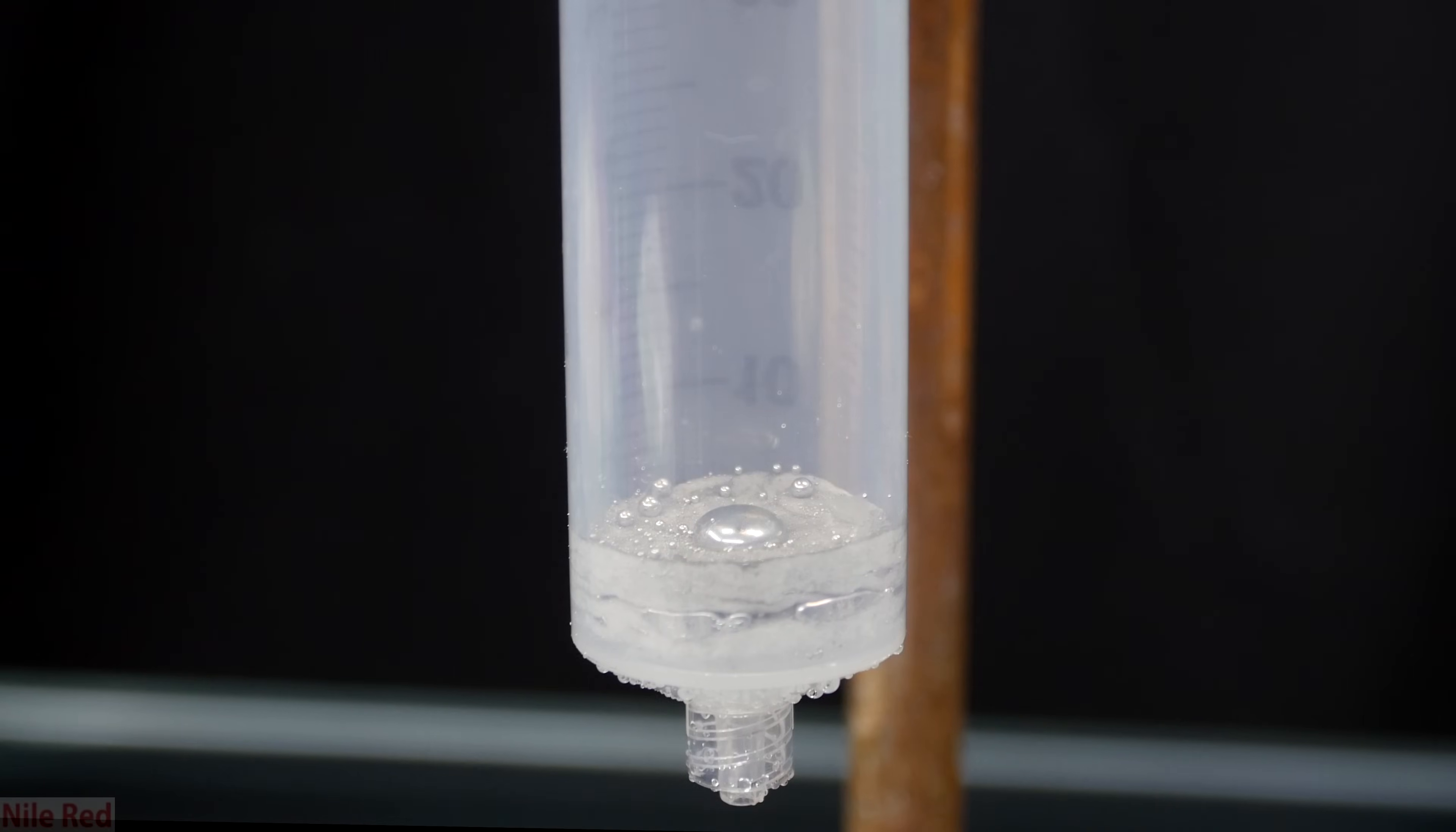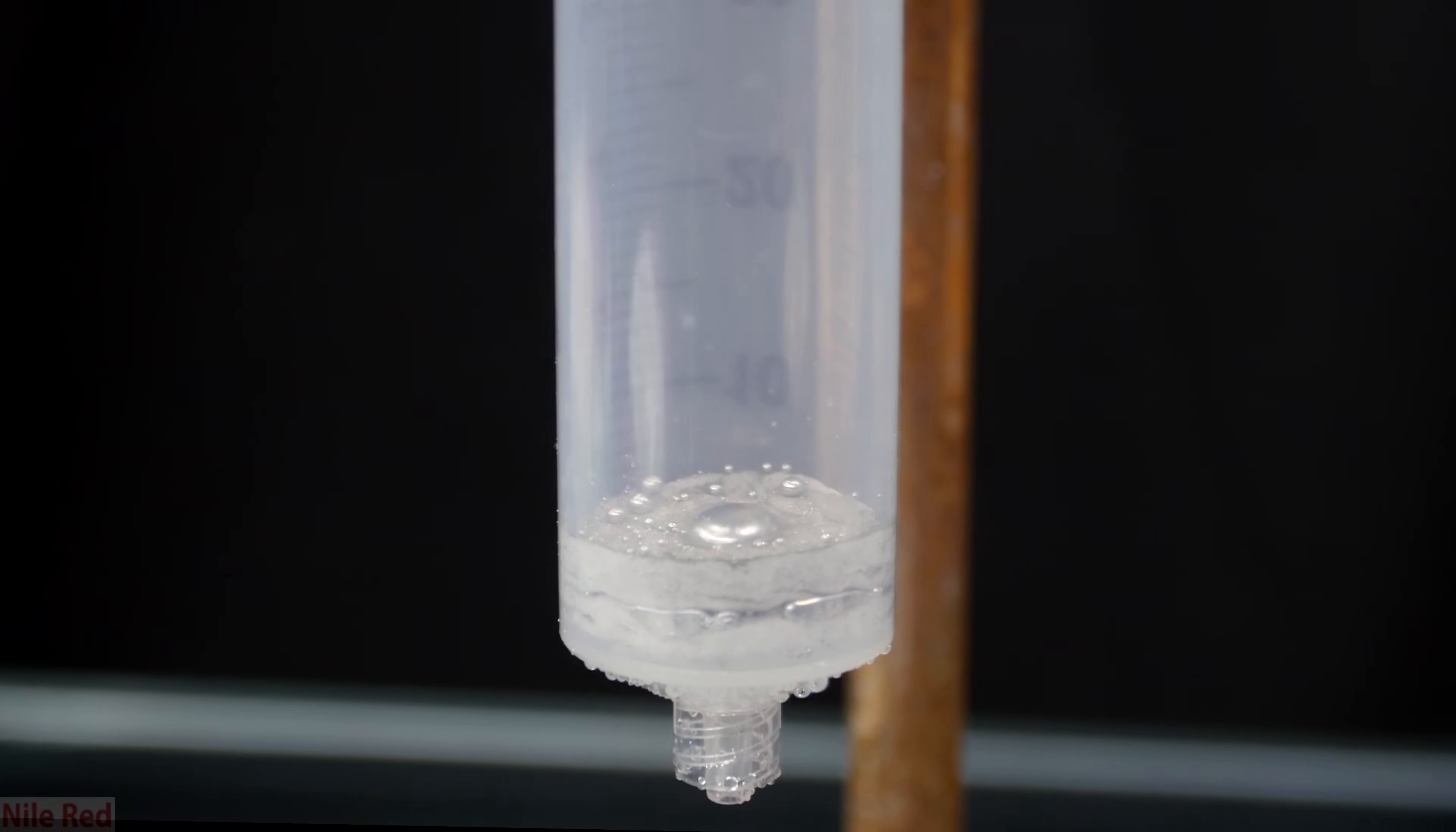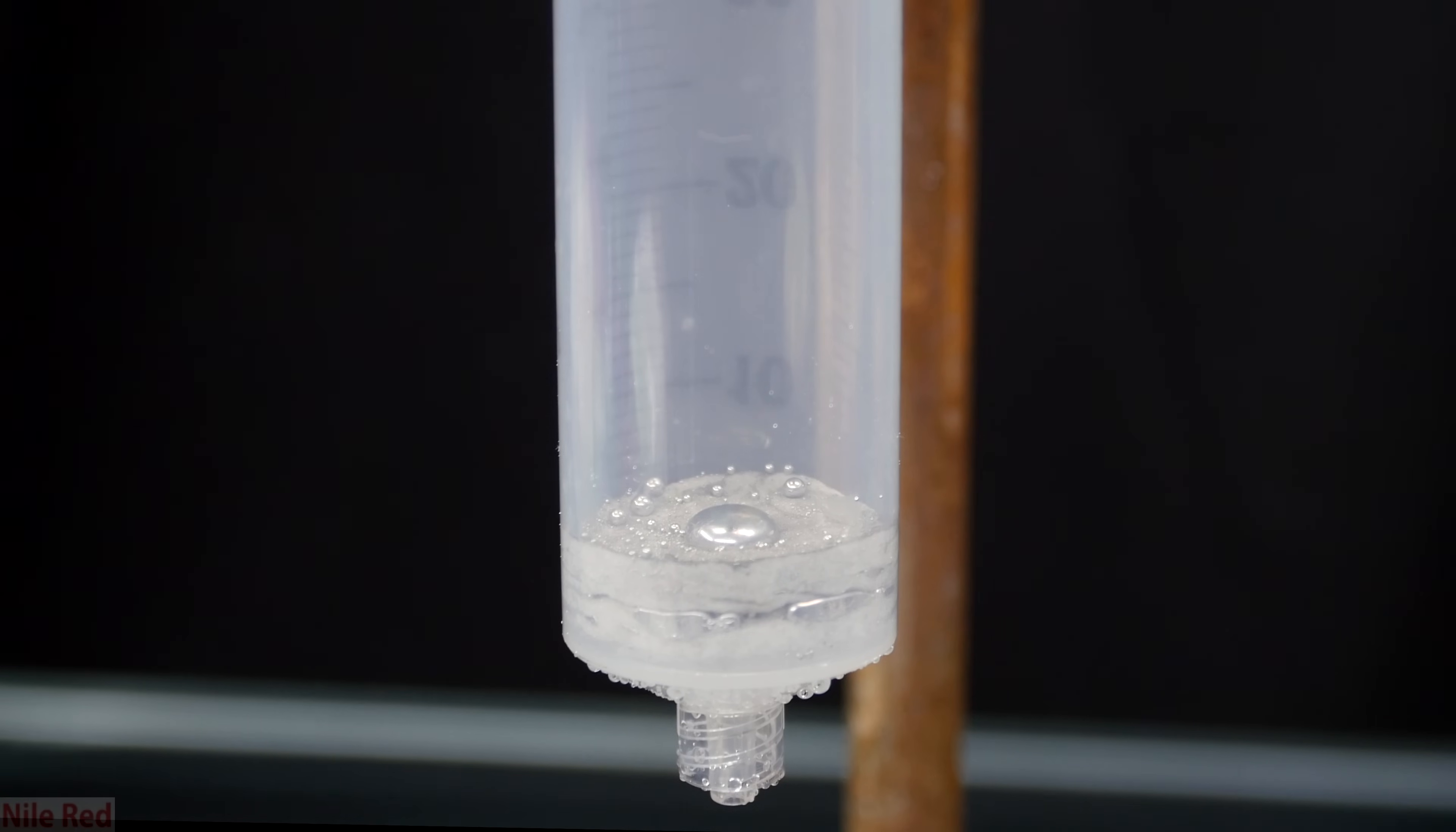In the syringe you can see that there's some mercury that doesn't make it through and it's inevitably lost. My mercury was already quite clean and didn't have a crazy amount of insoluble impurities, so you actually can't really see them on the cotton.